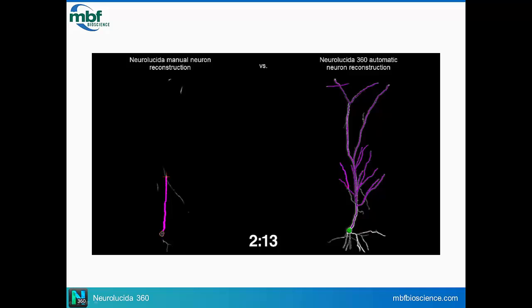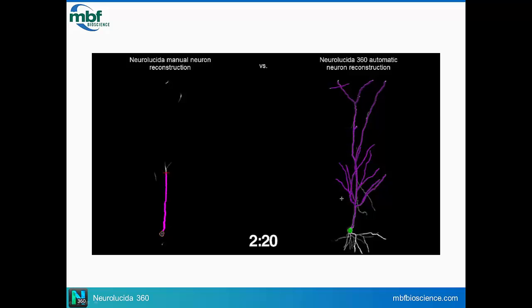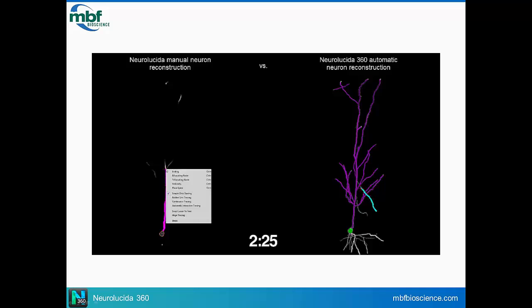Speaking of lipofuscin, how do you minimize that? You must have to deal with that in aging. Yeah, we do have a lot of that in our aging animals, and especially with the Alzheimer's disease mouse models. But there's a couple ways. There's a really good review or a paper by Schnell et al. from 1999, which went through what's the best methods for getting rid of the lipofuscin or reducing it, and pretty much just incubating it with a solution of Sudan black B or in a solution of copper sulfate. It really helps get rid of this lipofuscin, and it can make the tissue a little bit more fragile.